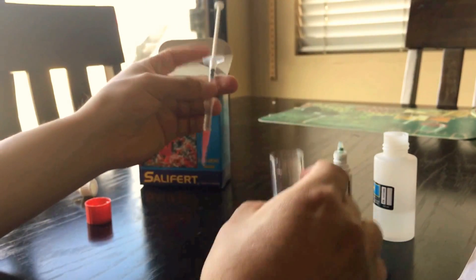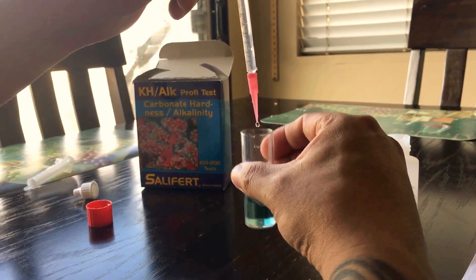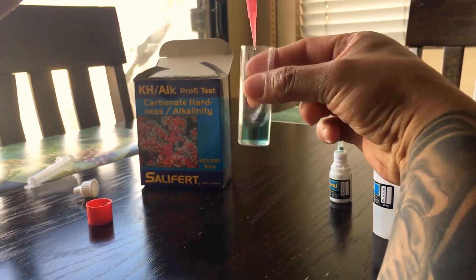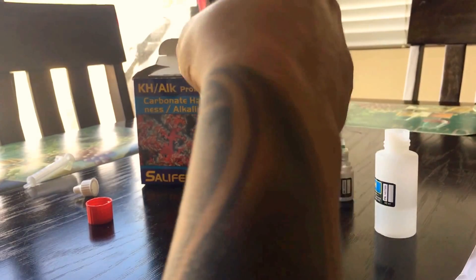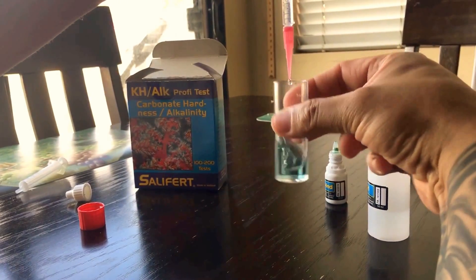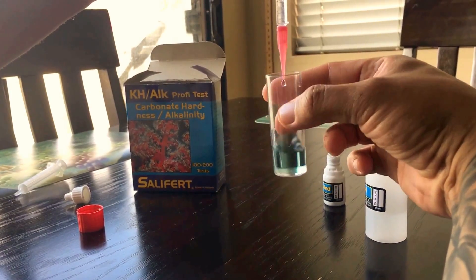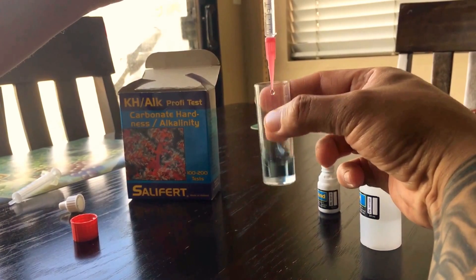Now put this syringe in and start adding the solution. You can do it faster or you can do it slowly, drop by drop. By the time you do it, give it a little shake.